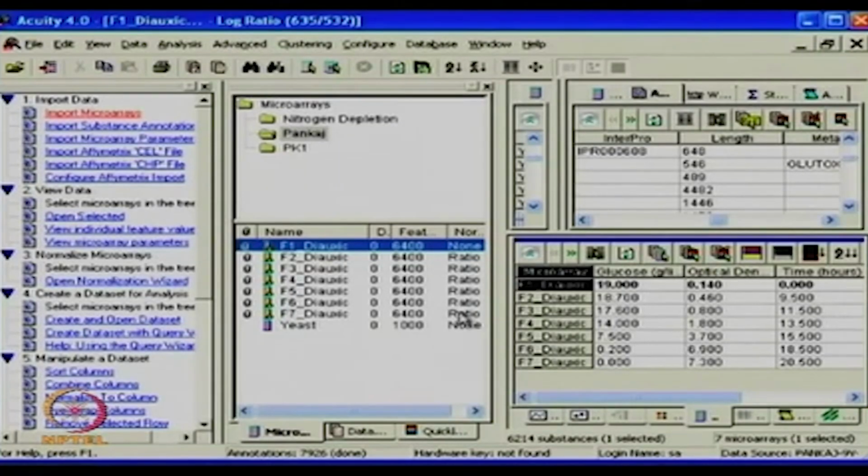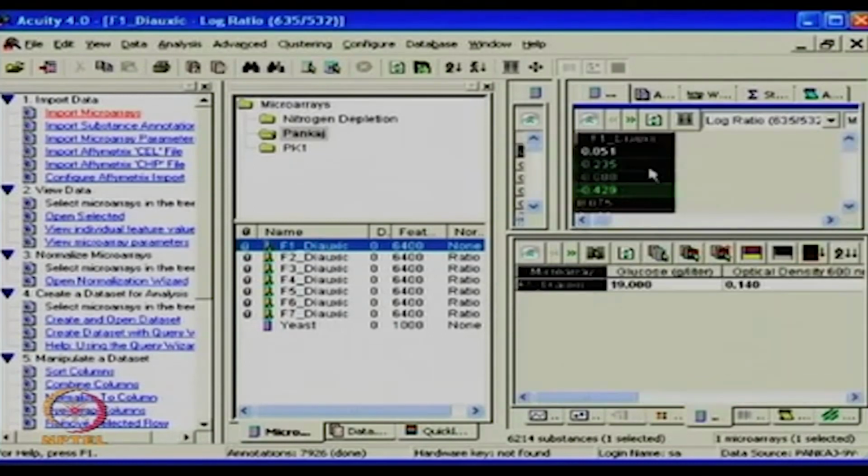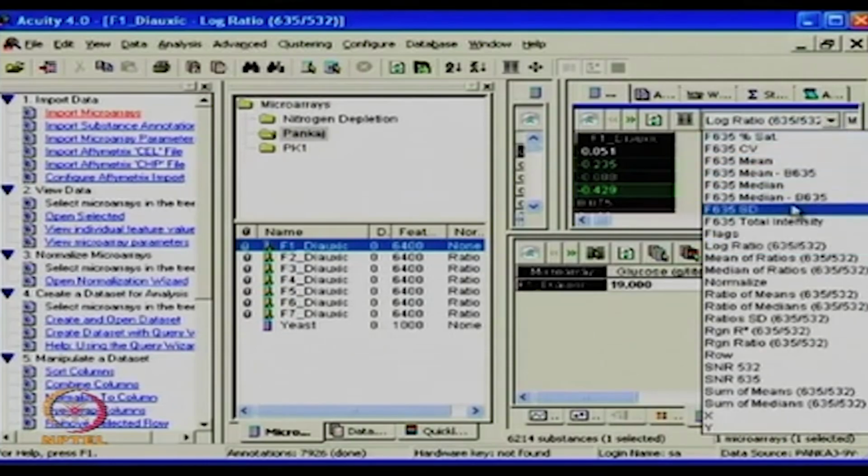Sure. So here in the working area which we have defined, it is split into two. The top allows different data visualization methods, showing what different features and what different arrays there are. Say, for example, I only open one array, it shows me only that array and tells me what I am looking at. I am looking at log ratio data. In a similar fashion, I can look at any other one, because it is a GPR import, whatever GenePix data you have to watch for.